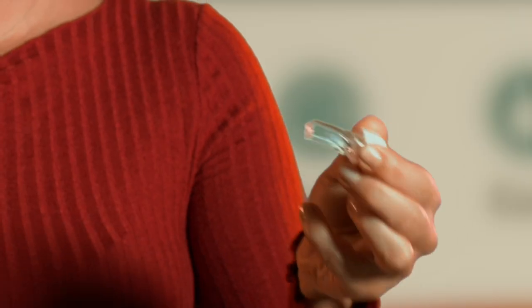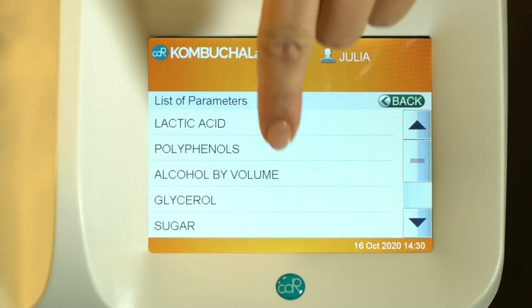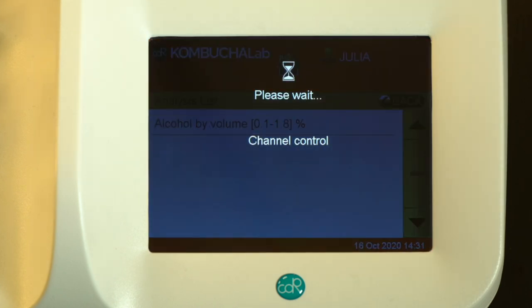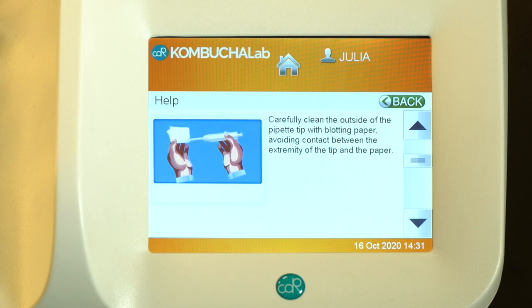And after that, the sample is ready to be analyzed. Remember that there is always the help function. You can consult step by step the analytical method.